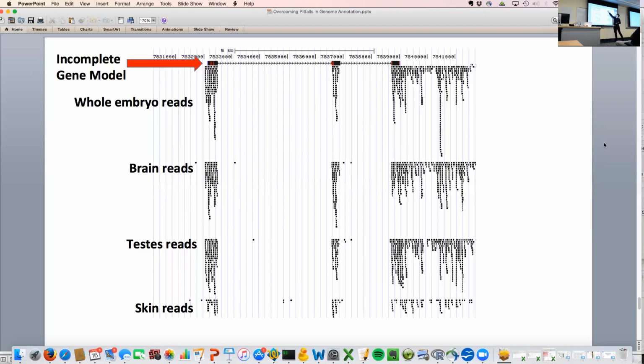But then you see, after the end of your gene model, it continues. And so if you're just using one of these automated RNA-seq pipelines, none of these reads get counted. These are the only reads you'll have to give you information about what genes are expressed. Another issue here is that if you have two really similar genes, the best pipelines will throw away reads that map to both, because you can't confidently say that it came from this gene or that gene. And so the 3' UTR is where you're going to have a lot of reads that are really specific to your transcript.